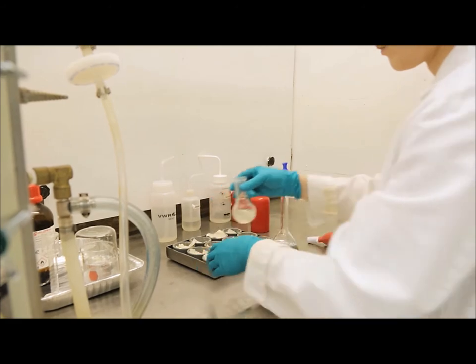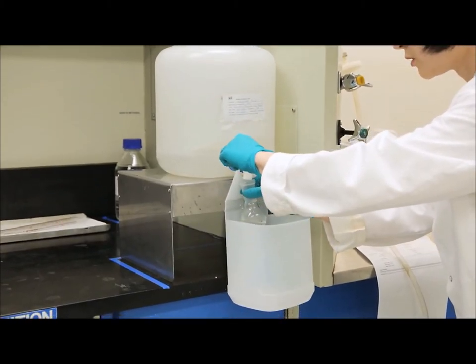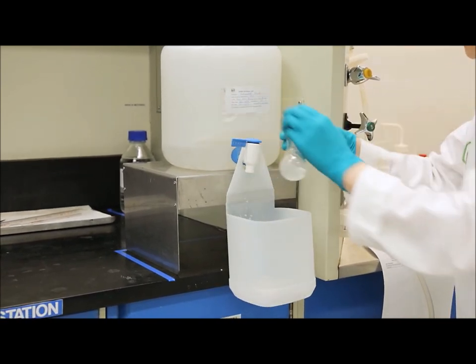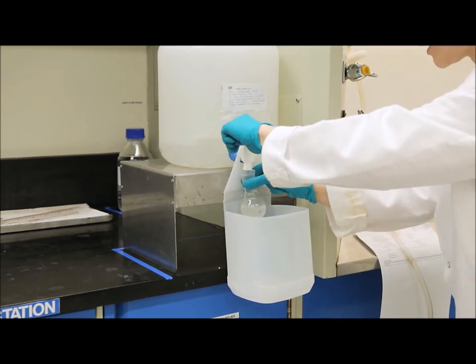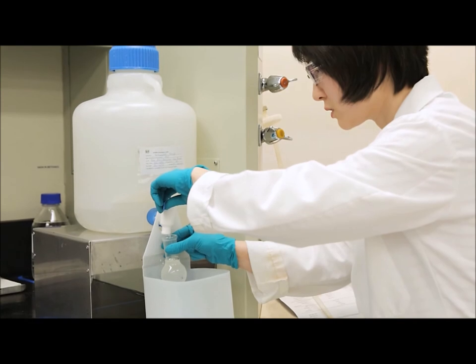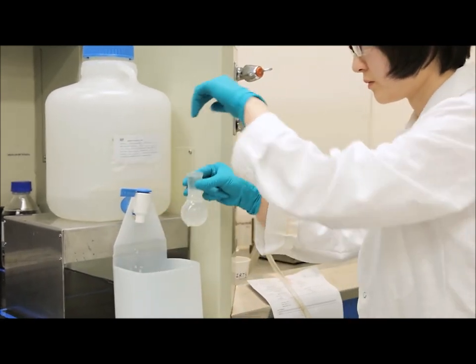Now that the internal standard has been added, next we're going to add our saturated sodium chloride solution. To begin, we fill the flask approximately half full, and we make sure to swirl the sample well. Once we have swirled the sample well, we can continue to add the saturated sodium chloride solution until it is almost full.